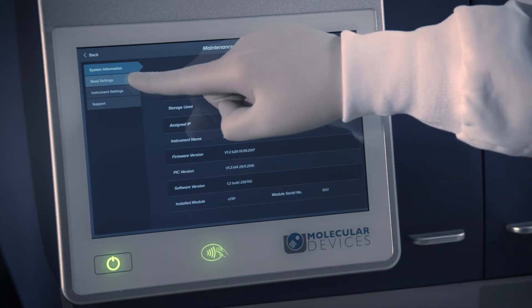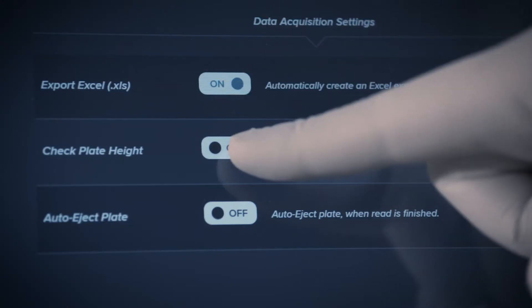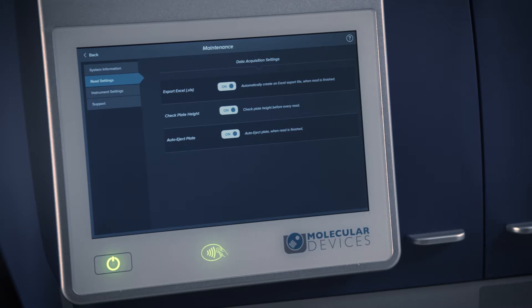In the Read Settings tab, you can adjust global read preferences, including options to automatically export data to an Excel file, check the plate height before every read to improve signal detection, and automatically eject the plate after a read is completed.